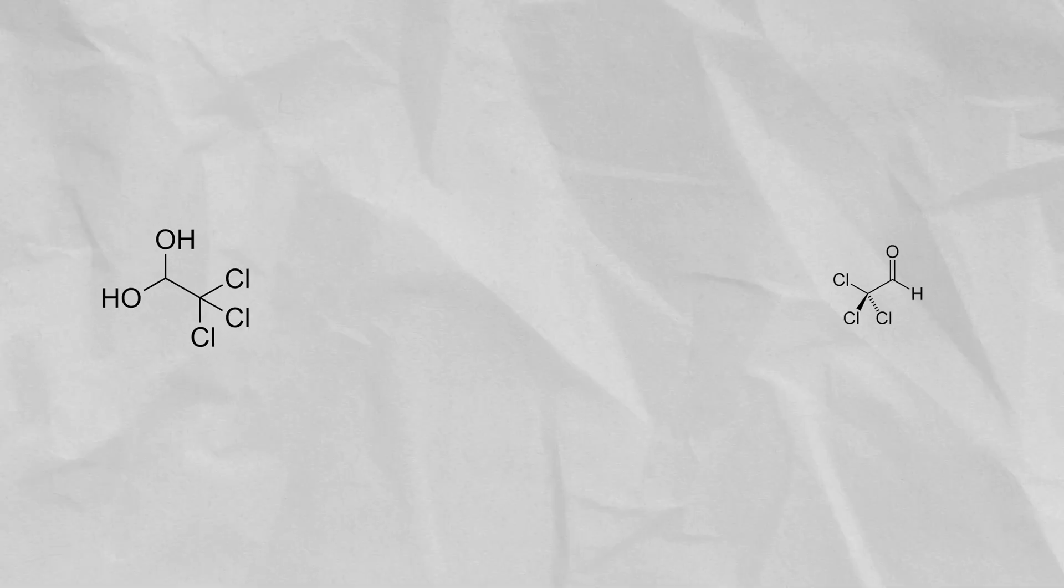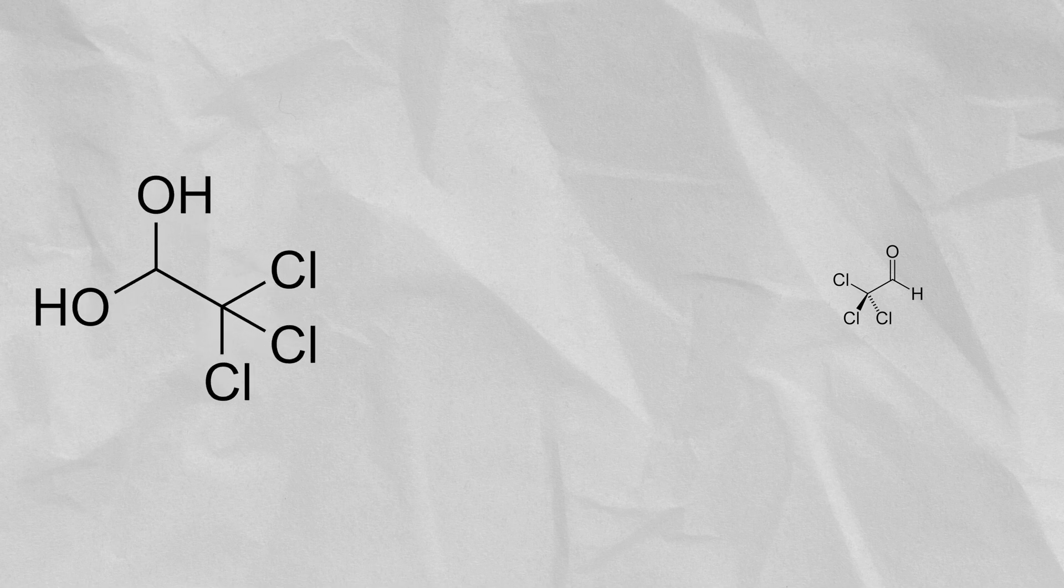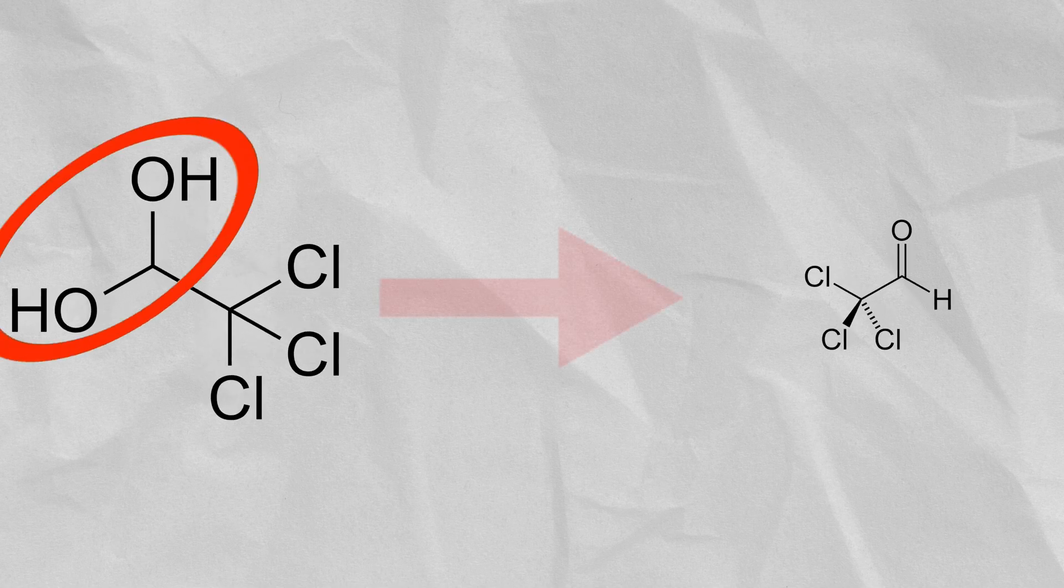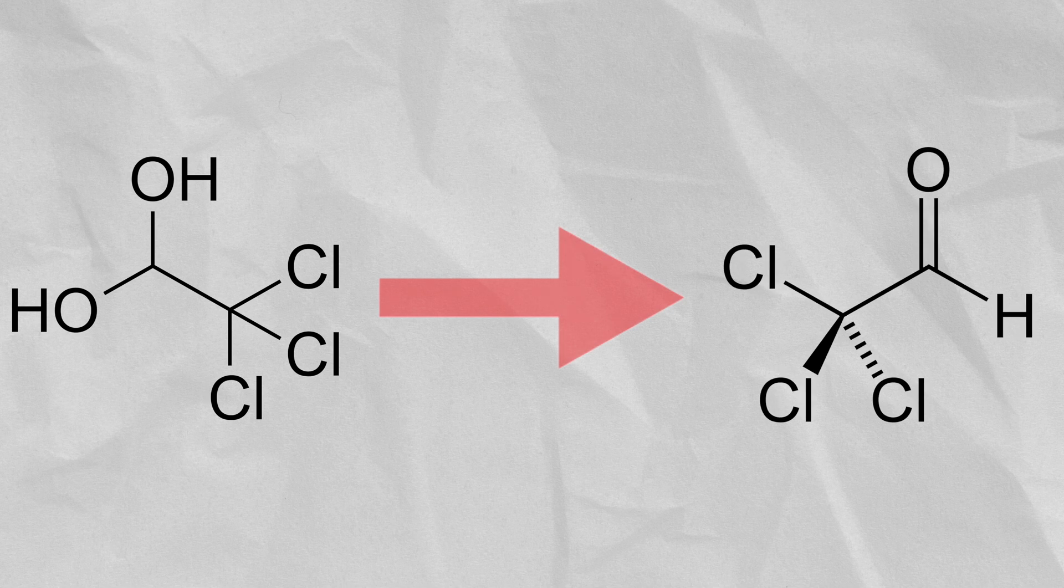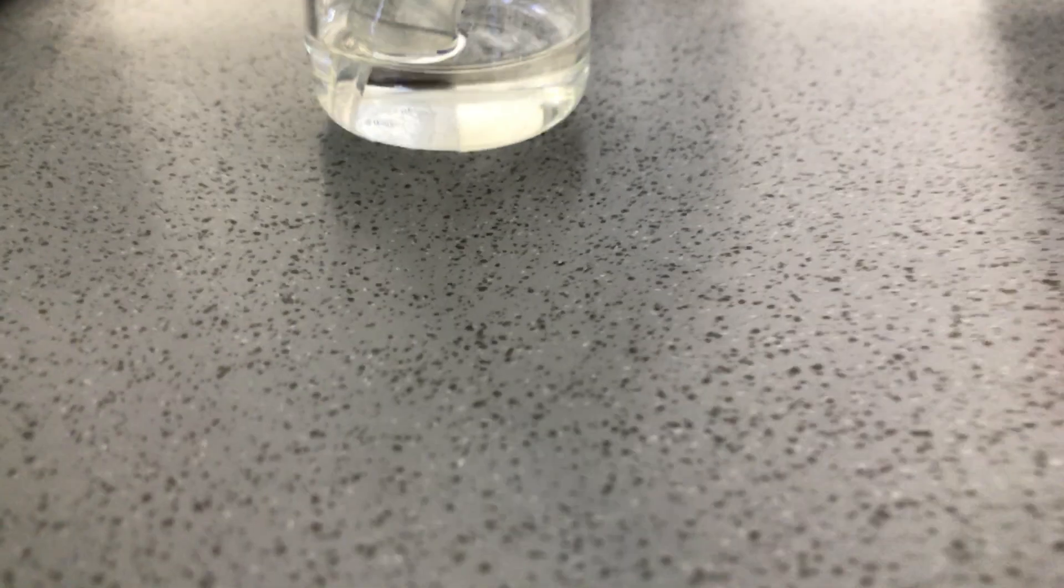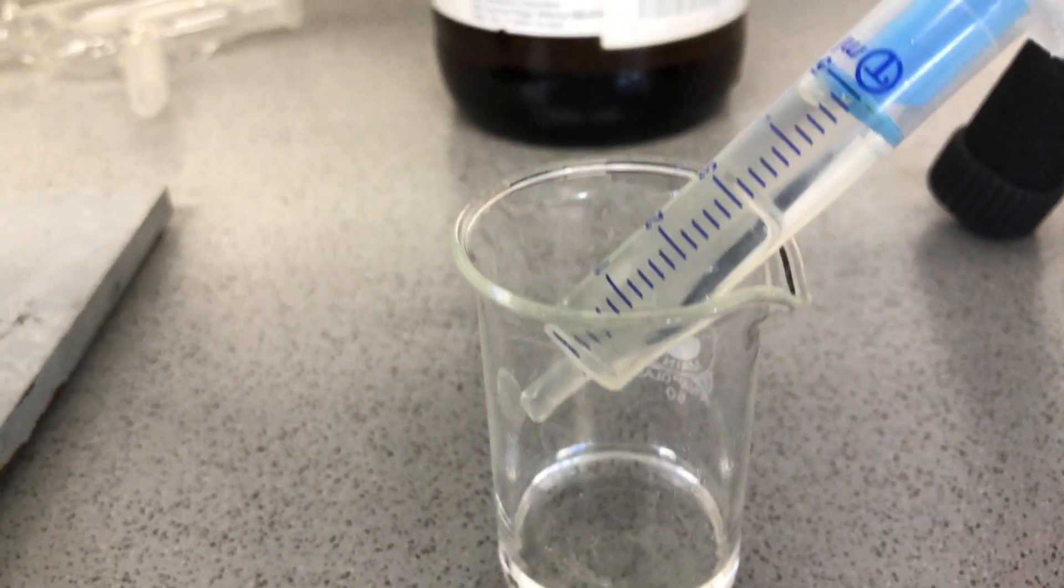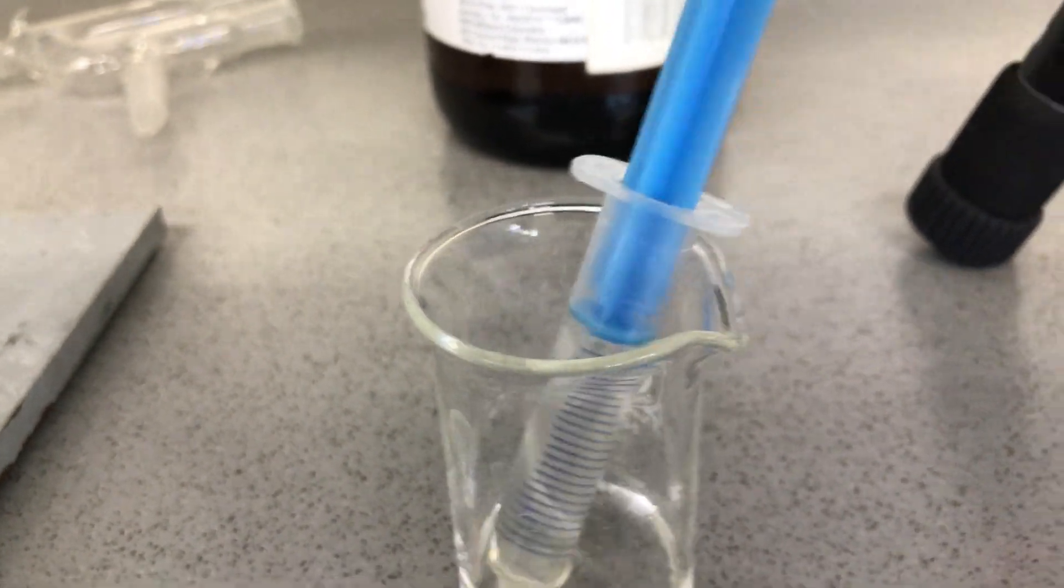Why do we need sulfuric acid? Well, on the left you can see chloral hydrate. See those two hydroxy groups? We need to remove them. With the help of sulfuric acid, we rip off one water molecule and end up with chloral. So 5 mL of sulfuric acid were measured out using a syringe.